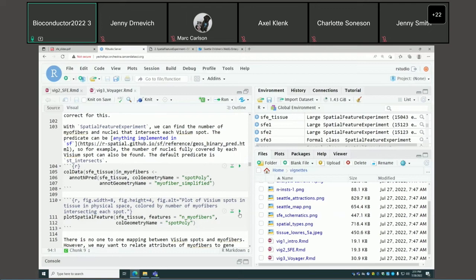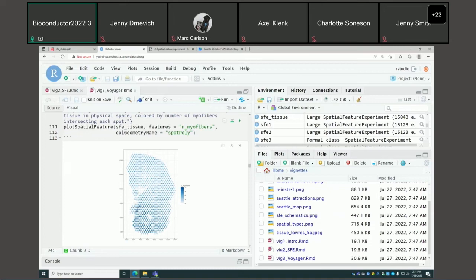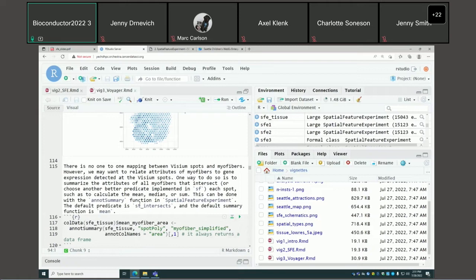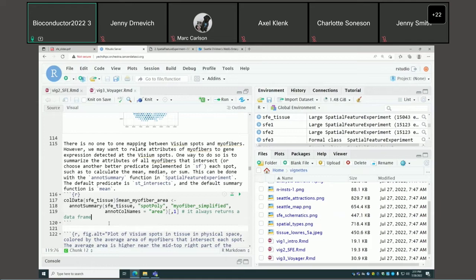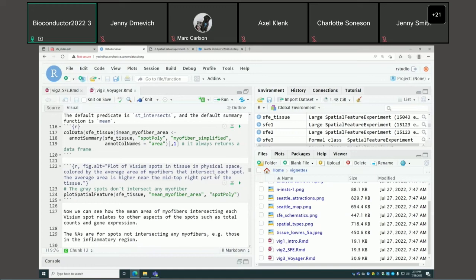Here we see how many myofibers intersect each Visium spot. Regions with intact myofibers will have a larger number of myofibers per spot. There's no one-to-one mapping between a Visium spot and the myofibers. So if we want to relate attributes of the myofibers to gene expression in Visium spots, we may need to summarize those attributes — for instance, average the area of each myofiber intersecting each Visium spot.